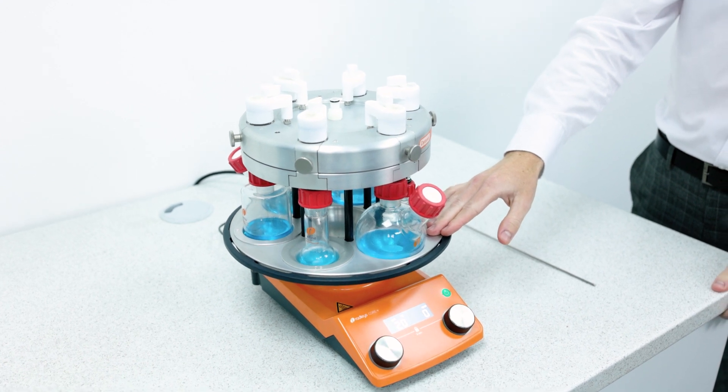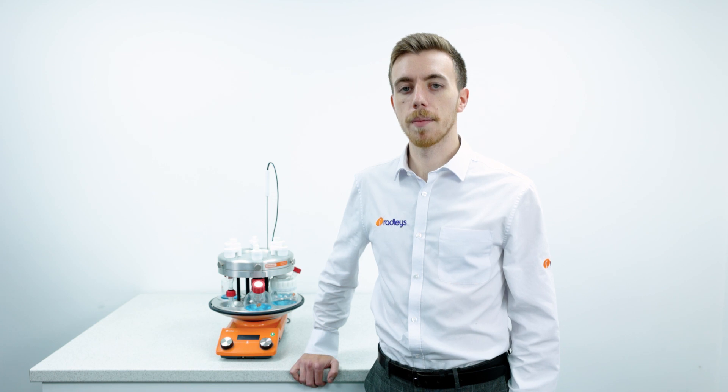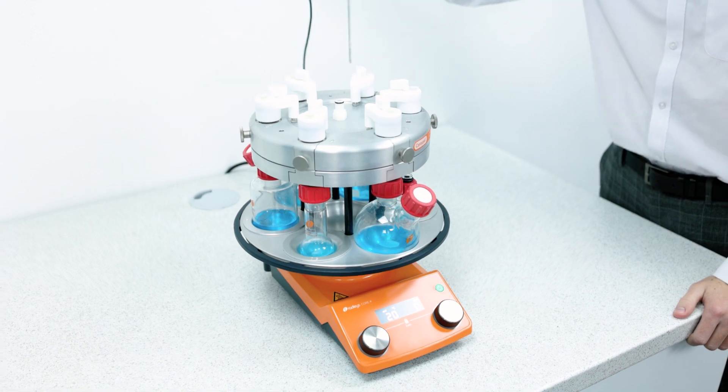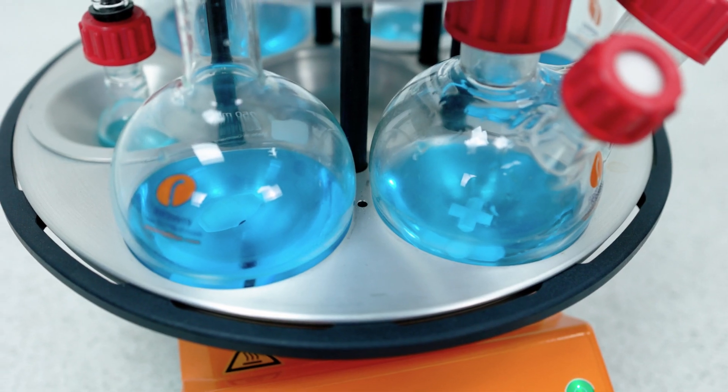For efficient and uniform heat transfer, the Carousel 6 Plus base is constructed from a single piece of aluminium which is then anodized to provide excellent chemical resistance. We can also locate the external PT-1000 temperature probe into the base for more precise temperature control.